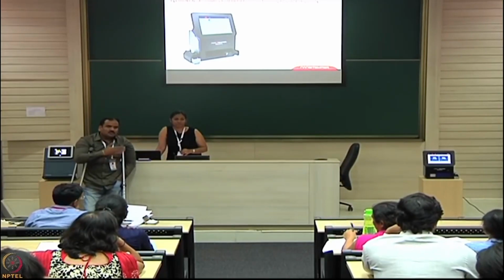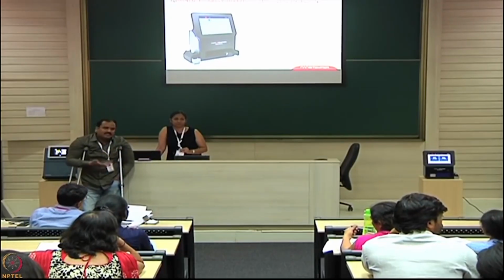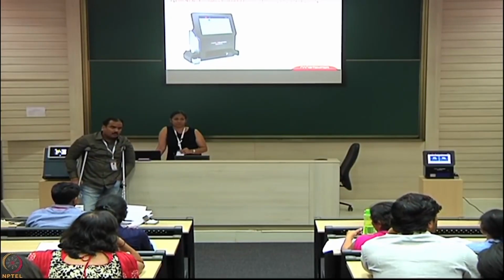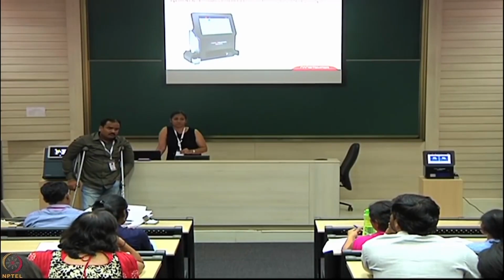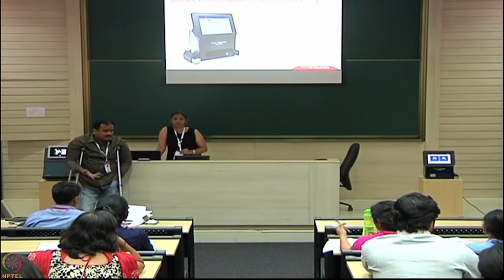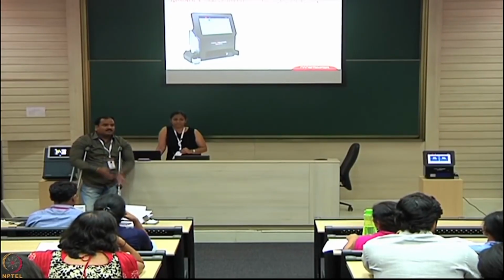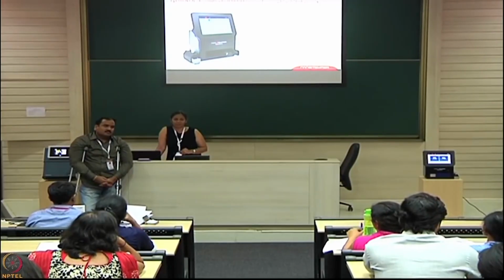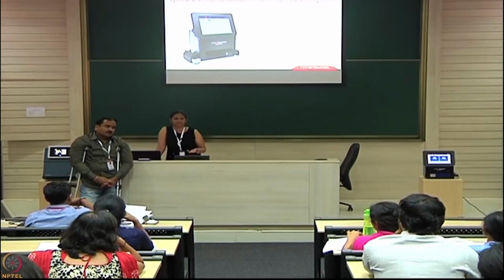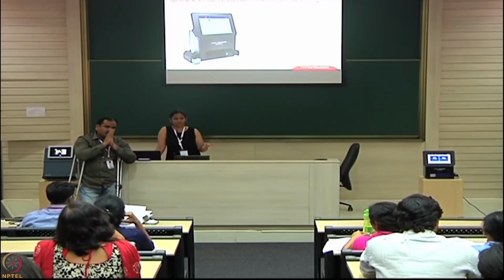We say a positive shift is towards the right side and a negative shift is towards the left side. The left side is always destabilizing your complex or your protein. But it's not supposed to shift, in principle, no. Storage conditions, or so many other factors. Because in a few of the demos we have seen this kind of shift, where there is a positive shift as well as a negative shift.